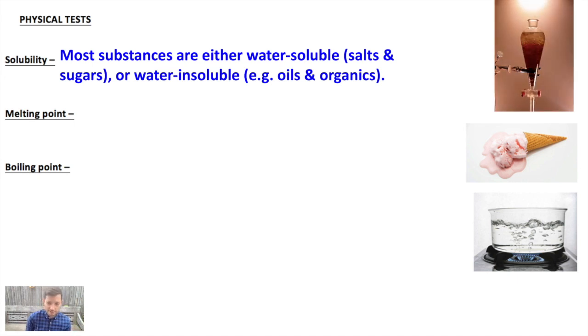These, what I'll call physical tests, have the advantage of the fact that they don't chemically change the identity of your substance. The ones we just looked at, the Tollens test, the starch test, and the pH test, those actually require you to chemically change the identity of your substance, which means you have to sacrifice some amount of it in order to tell what the result is. If I check for the solubility of something, I could imagine recovering that substance just by evaporating the solvent. And then on the right there you see what's called a separatory funnel. That's actually a separation technique. If you have 2 liquids that are not mixable, aka they are immiscible, they'll layer on top of each other, like oil and water lay on top of each other, and you can separate them just based on density differences.